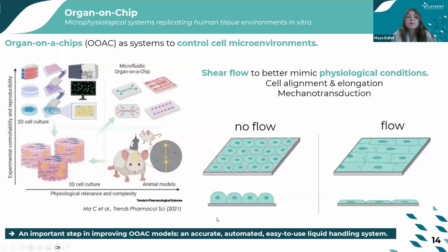This is especially important for active tissues that we often have in organ-on-chip models, like liver, kidney, or gut, intestinal epithelium, for example. Indeed, if the flow is too low, then you can have a gradient of nutrients or oxygen that can appear inside the channels, and this can lead to hypoxia, metabolic stress, or even cell apoptosis.